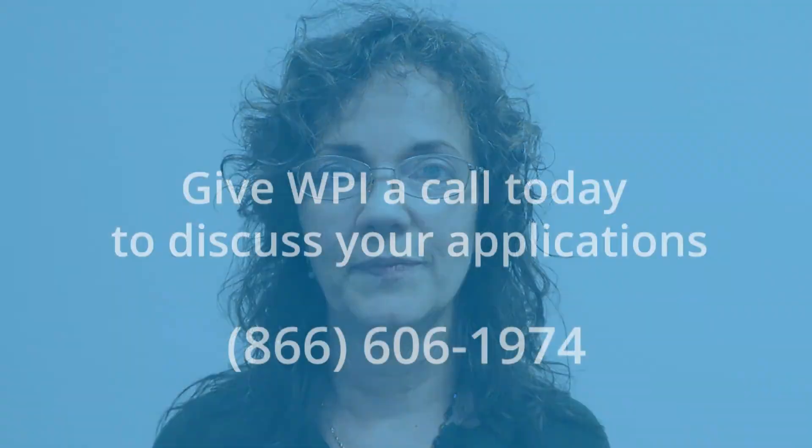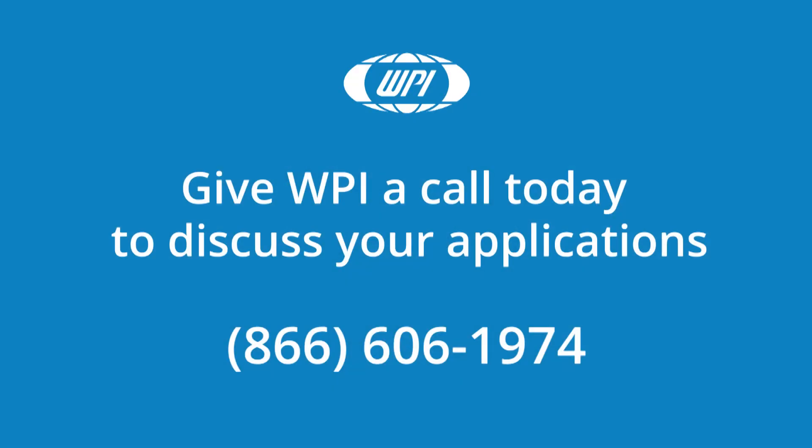The Pull 1000 can produce a broad range of tip diameters and shapes. If you have any questions, just give us a call.